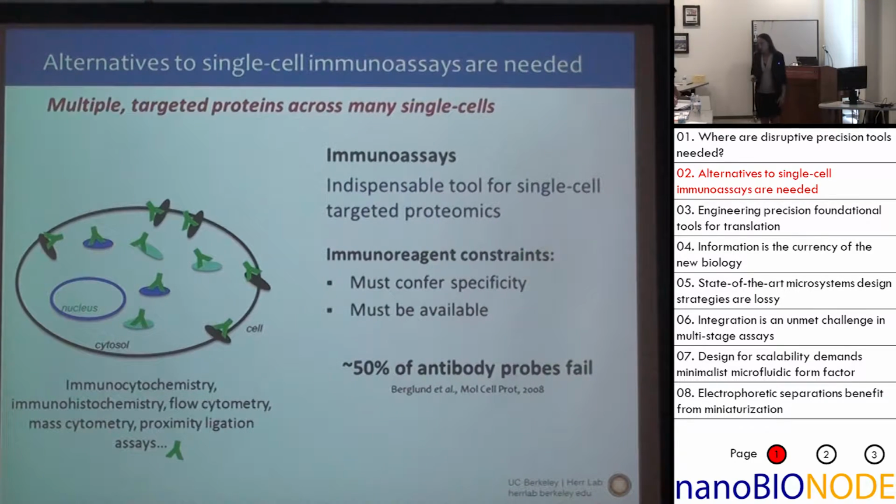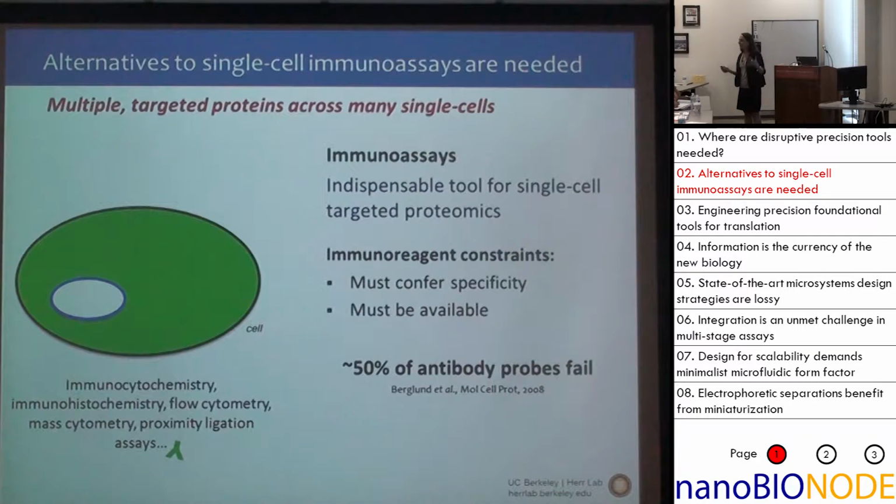It's an off-target signal. So when we do something like IHC, we don't image all the way down to the single antibody level, right? We take a fluorescence image of the cell, and basically what we see is there's a positive signal here, right? The antibody is binding. It's binding to the transmembrane protein, it's binding to the truncated isoforms, and it's binding to some cross-reactive signal. That's not what we want, right? We just want to know signal from the truncated isoforms versus this transmembrane protein. That, I would argue, is one of the biggest challenges in modern analytical science for proteins to date.